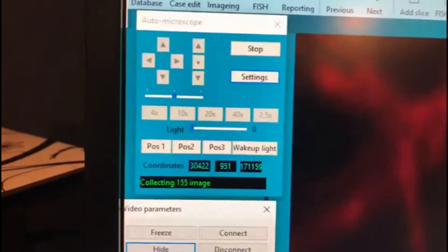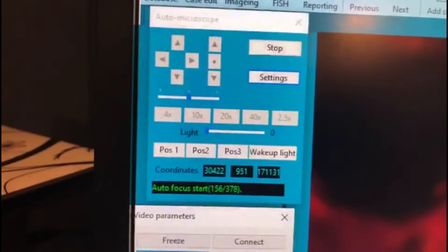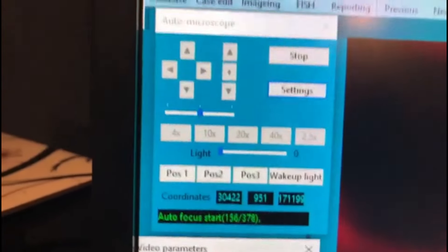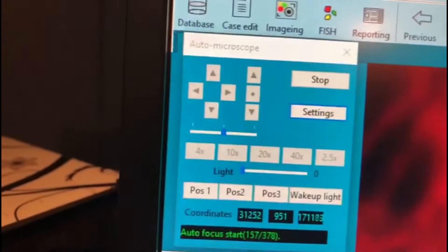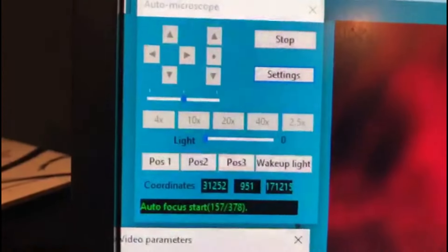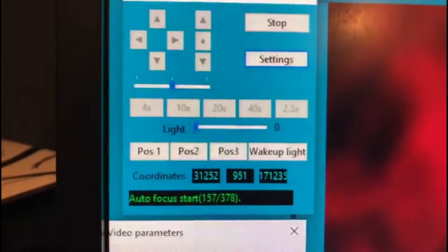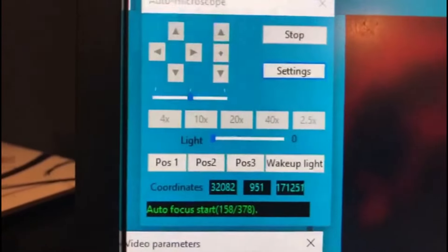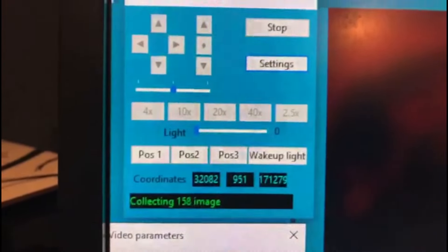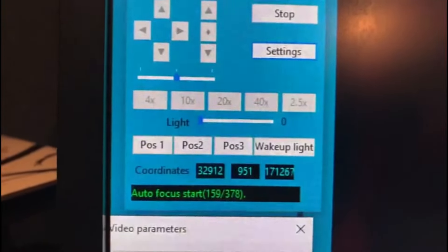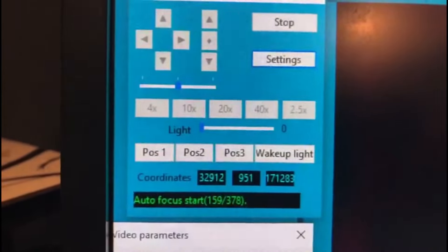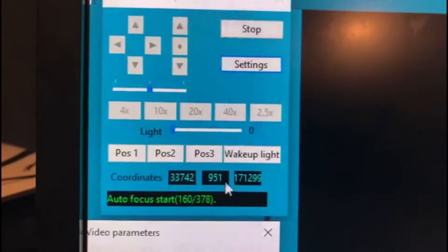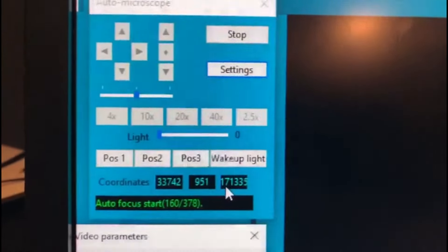To show you the progress: we are collecting 19 by 20, which is almost 378 images, and we are almost at the middle of that. This shows the focus-after-focus at every spot and the progress. We can also see the XYZ coordinates for the current position at which we collect the image.